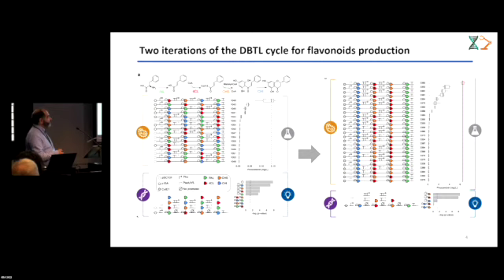Based on that initial iteration, we went through a second iteration, in which we found that the titers increased substantially from our initial run. That was like a proof of concept. We saw that we can compress the design space a lot, to focus on those factors and combinations that are really relevant.